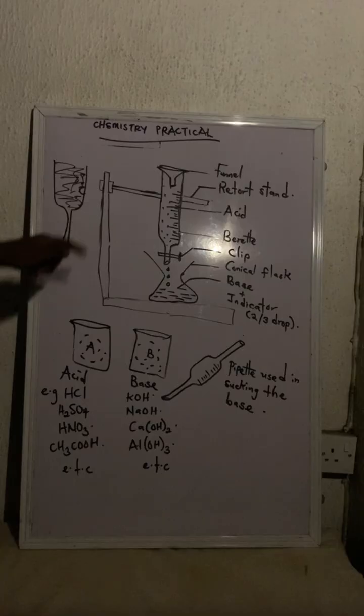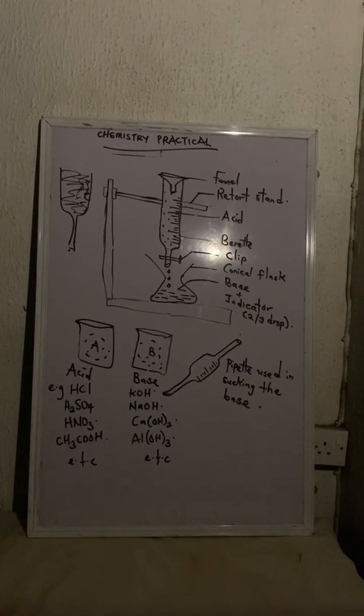You'll be seeing water. So you just see one part. Maybe one part like I have one small circle. You see that there's nothing in this. This is looking like a circle or something like that. There's no air that is entering into this place. So this is what we call air bubbles. So you have to make sure you avoid these air bubbles.